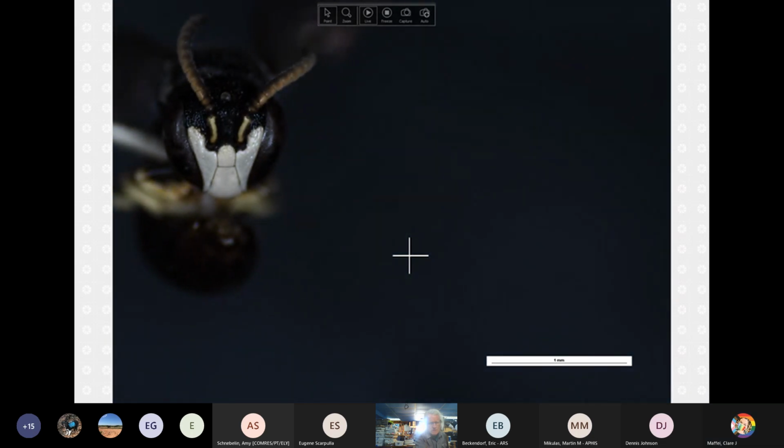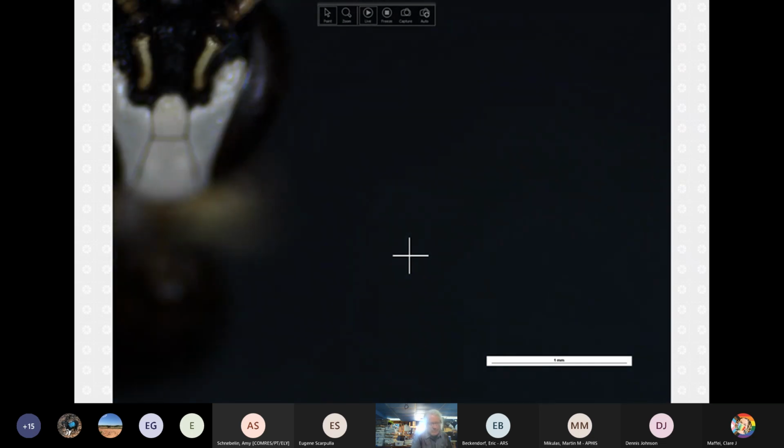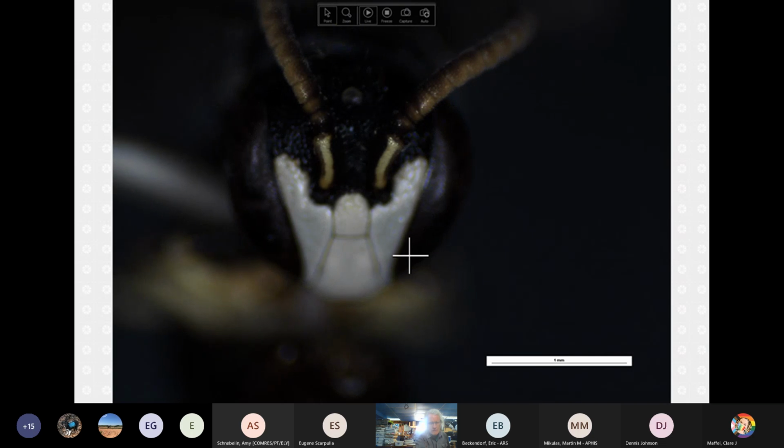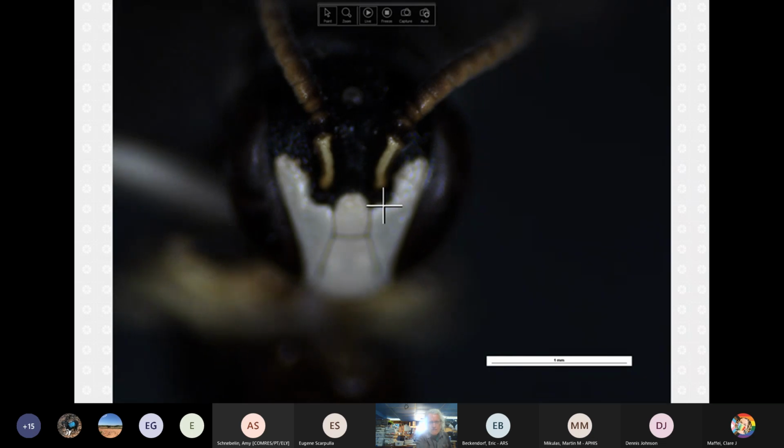Okay. All right. Here, very common pattern. I don't know what subgenus it is. It may be also in one of the other subgenera, but here we have this common pattern. This one has quite noticeable pitting again, which our modestus affinis groups does not have. It is white to off-white in the males.